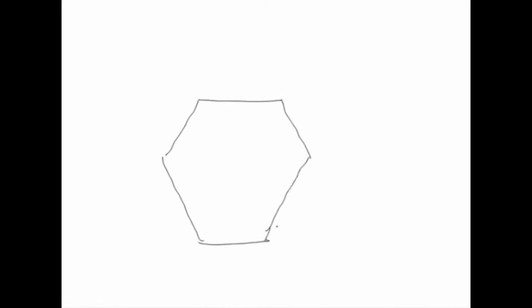It is not perfect, but I think you can understand that. Each leg contains this hexagonal array of electrode arrangement. Here each leg contains 4 electrodes, and these are 4 electrodes.